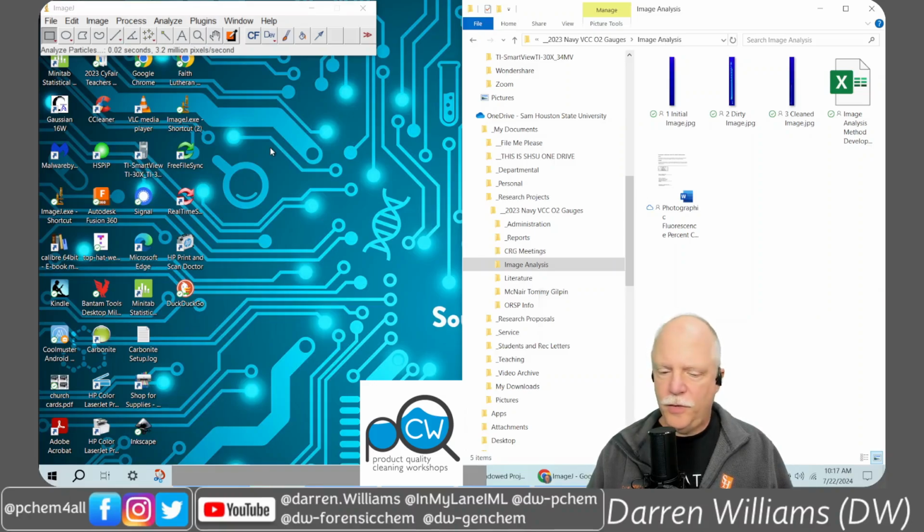Okay, this is a tutorial video on measuring the amount of fluorescence in our cleaning samples. We're going to start with just a couple of example images, and this is how you set it up. If you're going to do a new color, this is one way to figure that out.